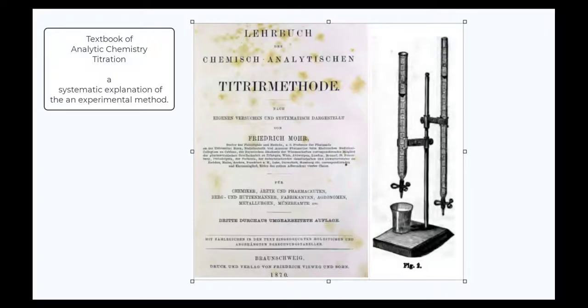Burettes have been the standard for determining volumes and titrations for over 150 years. Now, however, there are some new devices that will relegate that beautiful burette to a museum. Cue the music for the auto titrators!